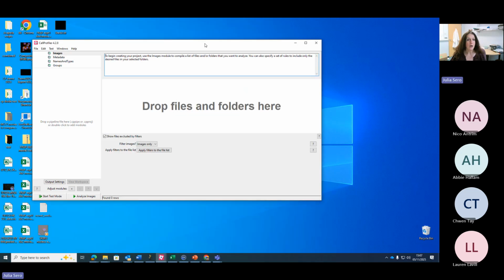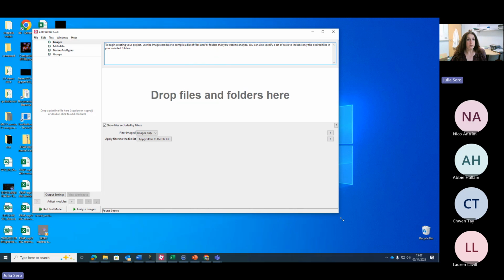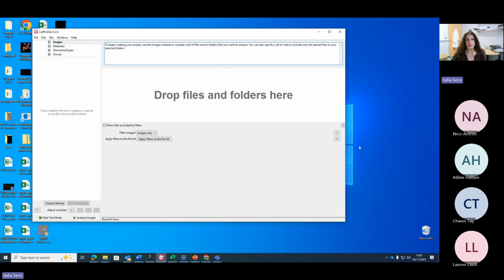But what I want to do here is take you through setting up some new data and then finding things, nuclei and cells in particular, in that data. CellProfiler is open source. It can interact with lots of different files. It can mix and match 8-bit images, 16-bit images, and RGB images, and combine those into whole image sets that you can analyze. This is not always the case. In ImageJ, for example, ImageJ does not like to combine 16-bit and 8-bit images. CellProfiler can do a lot.